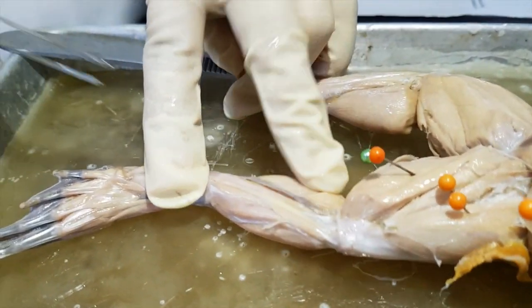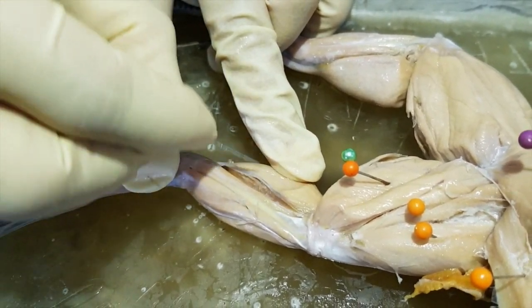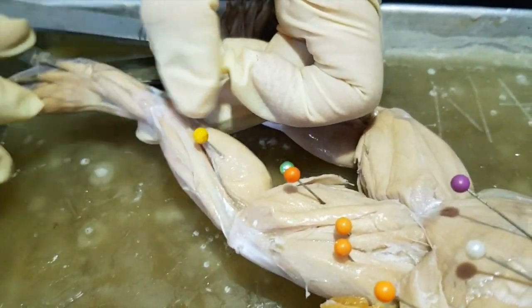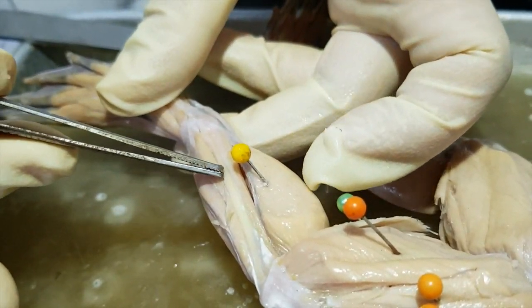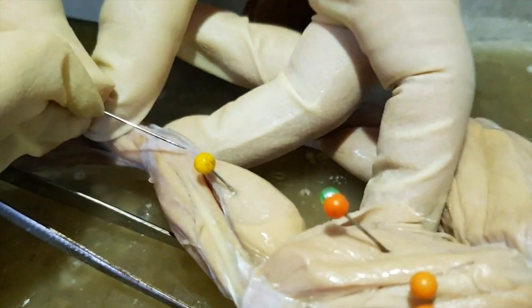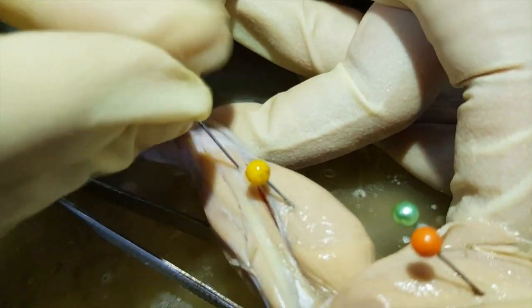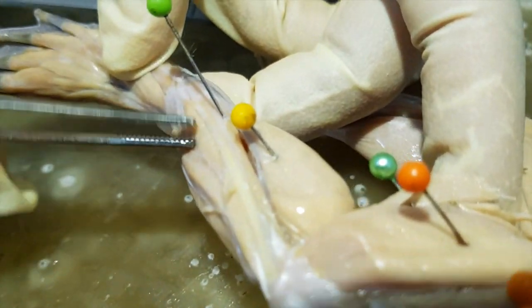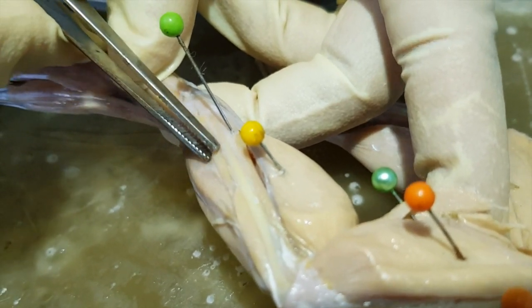For the muscle of the shank, we already identified previously that one, so that's the gastrocnemius. In here, the point of reference now is this bone. That's the tibia bone. On this side, you will see that there is a small muscle. That muscle is the tibialis posterior. This small muscle here that's triangular in shape is the extensor cruris.